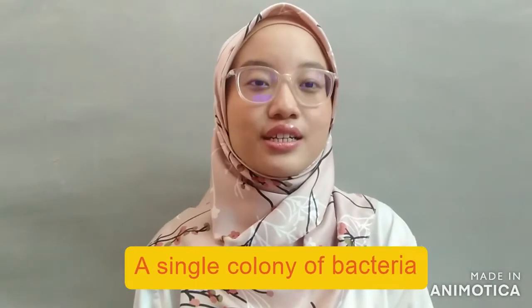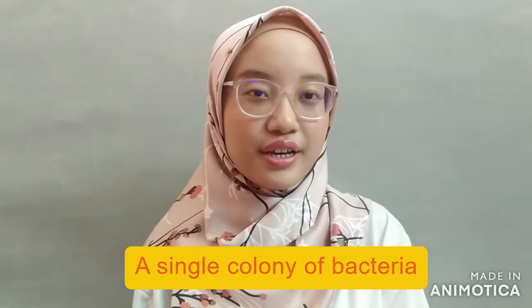So today in this video, I will show you the demonstrations and also explain a little bit about the principle of the streak plate method and gram staining experiment. The streak plate method is used by scientists to dilute or reduce the number of microorganisms so that they can obtain a single colony of the bacteria.